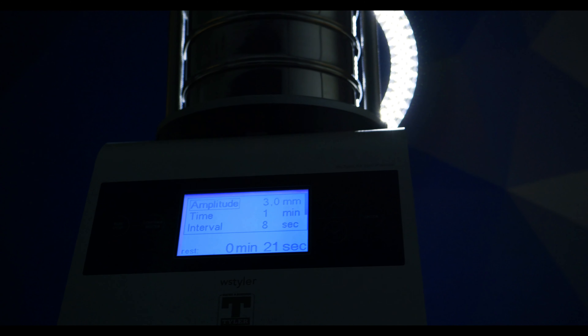Also, regardless of the size of your sieve stack, you'll need to use a collection pan. But the cover of the device will fit over the sieve stack, which eliminates the need for a separate sieve cover.